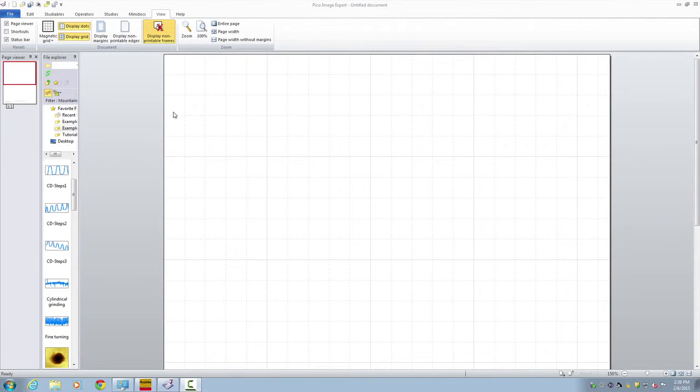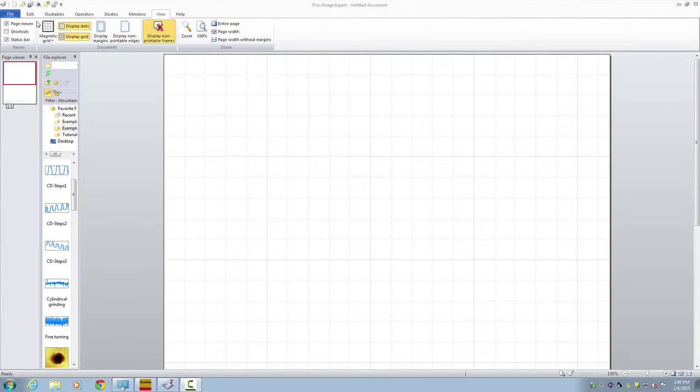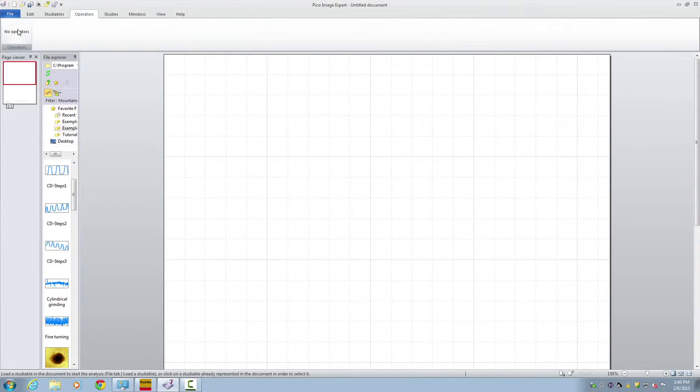In the software we first start with a new document. Pay attention that document is a file where we put all the processing and imaging together. So here we've got a file and a new document.